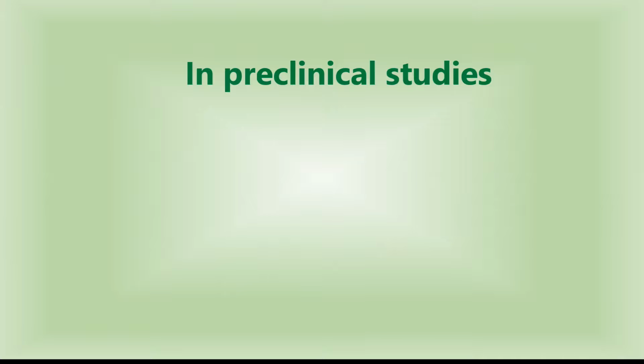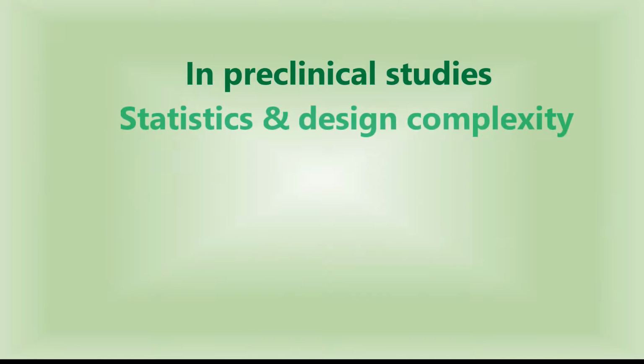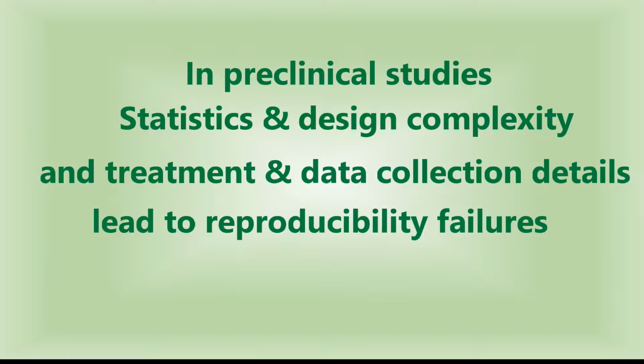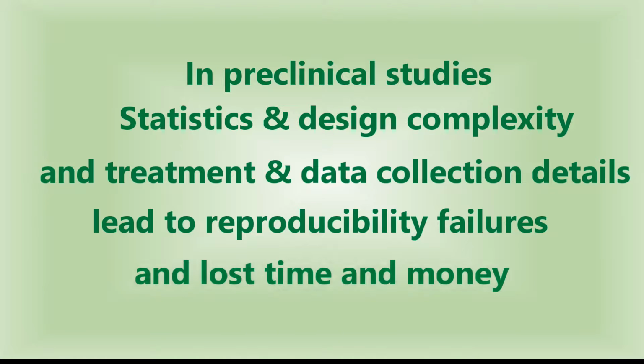World-class researchers who excel in scientific methods regularly get tripped up by the complexity and nuances of statistical models and experimental designs, and by the details of study execution, especially when delegating the details of treatment administration and sampling to a team. This results in animal study findings that are not reproducible in clinical trials or publication of misleading results. And this means a lot of wasted money, and perhaps more importantly, an enormous amount of wasted time the researcher can never recover.